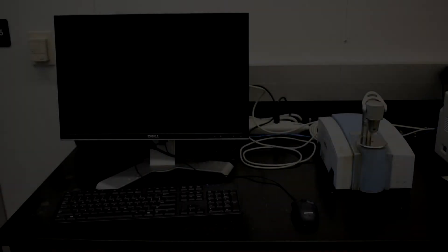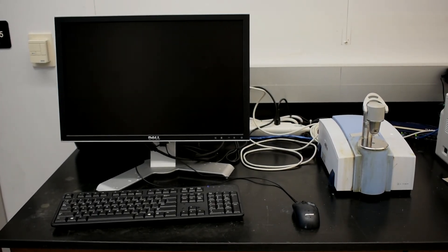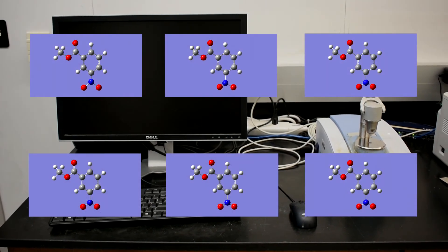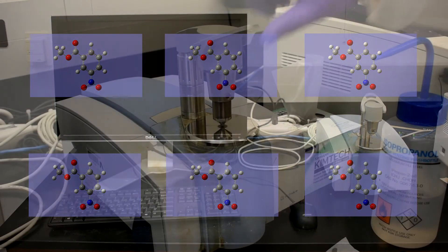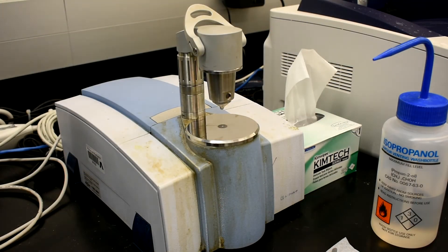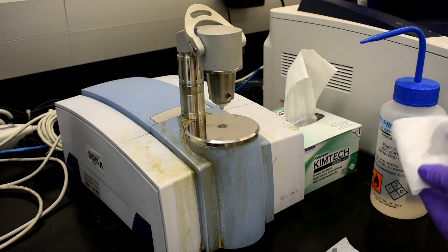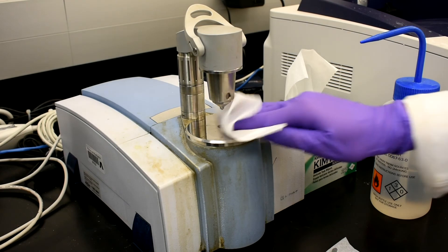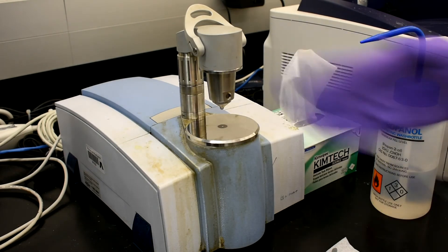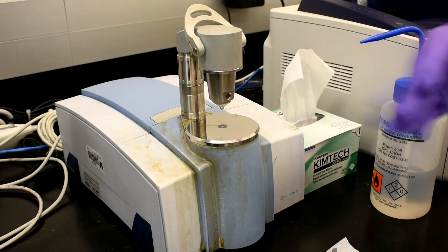Next, an IR spectrum will be taken to confirm the presence of the functional groups in the product. Make sure to identify all the peaks relevant to your molecule. Before running IR, make sure to clean the sample area by putting some isopropyl alcohol on a chem wipe and wiping off the sample area. Do not put the isopropyl alcohol directly on the instrument. Wave your hand to help dry the isopropyl alcohol.